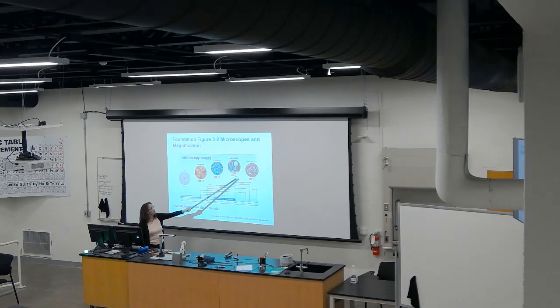This is the surface of the bacteria, and if you measure the thickness of the head of the virus, it can be up to 120 nanometers.